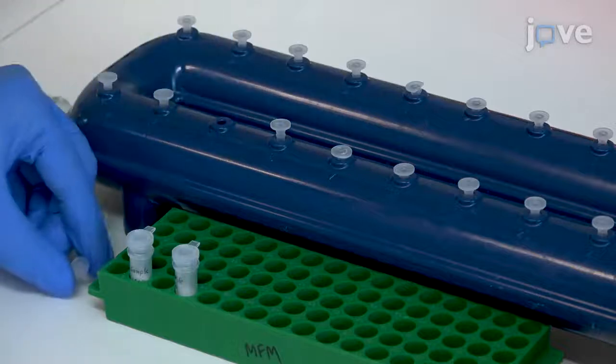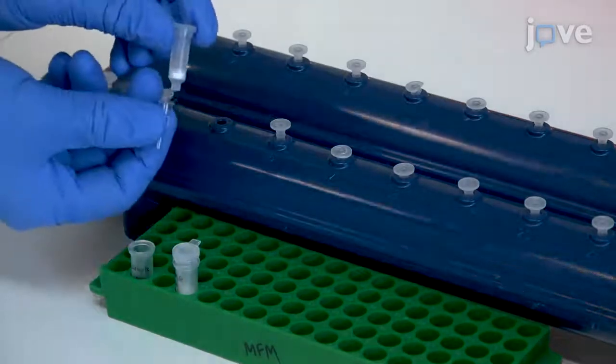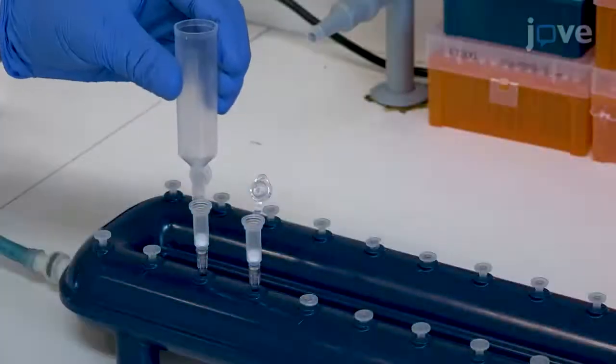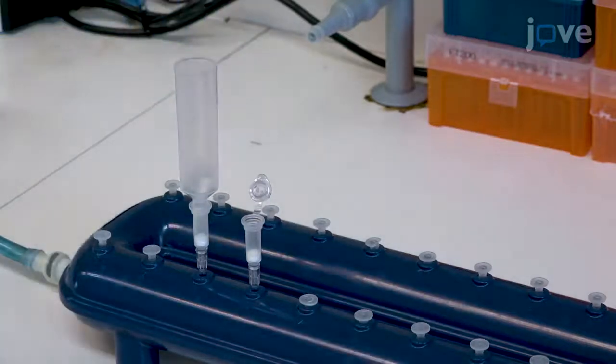After a 5-minute incubation on ice, insert a silica membrane column into a vacuum apparatus connected to a vacuum pump, and firmly insert a 20-milliliter tube extender into the open column to prevent sample leakage.